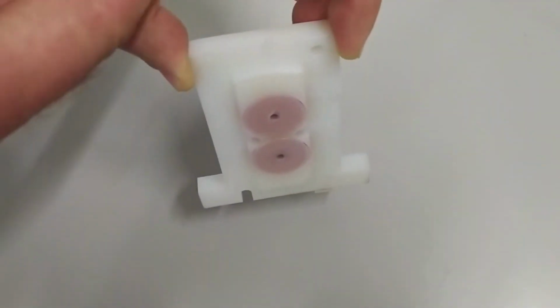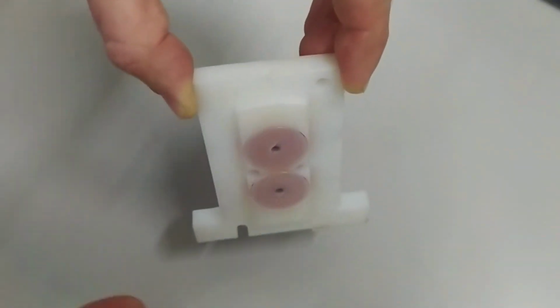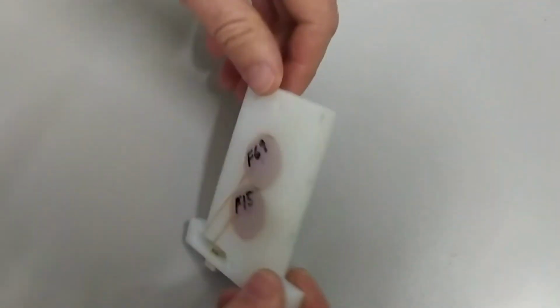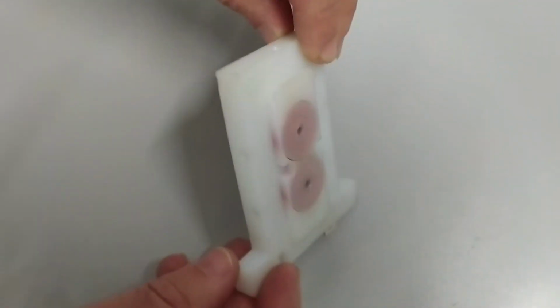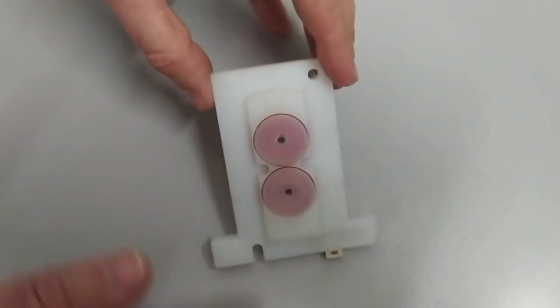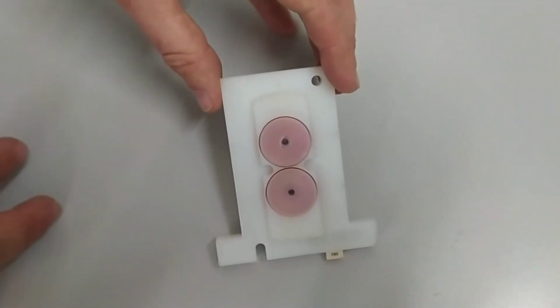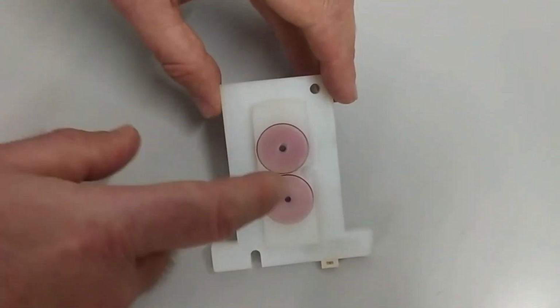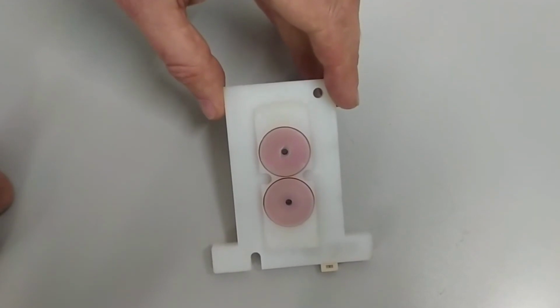The coils are placed in this way. This is the bottom of the magnet, the top one, and the sample vibrates vertically along this direction. There are two sets of coils, one on one side, the other on the other side. And as you can see here in the back, there are electrical connections that allow to connect them from the left side to the right side in the proper way to ensure that the region of uniformity and maximum sensitivity is in the middle of the gap, as we discussed during the theoretical lesson.